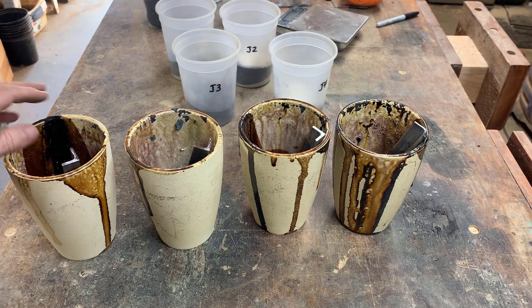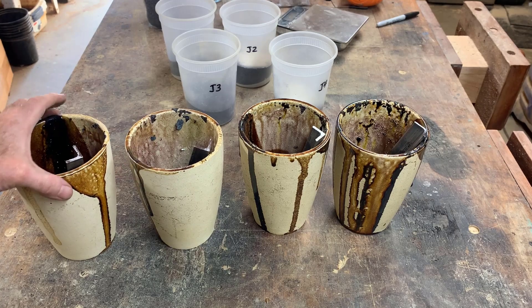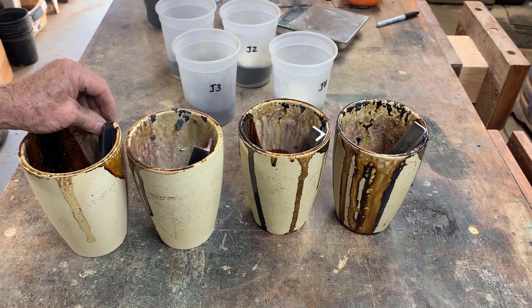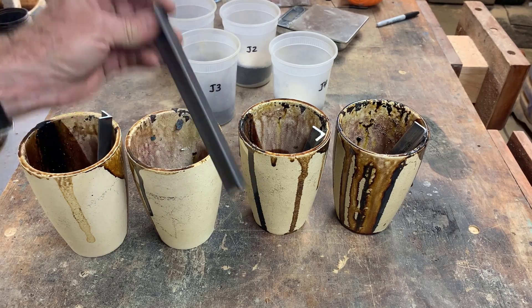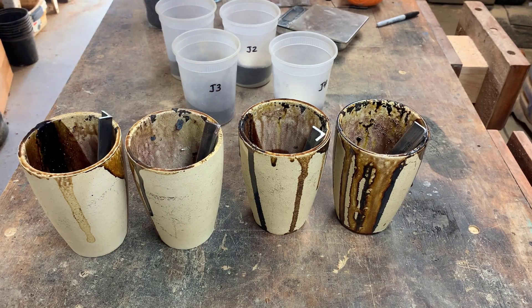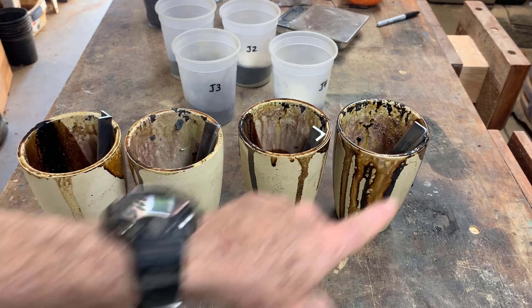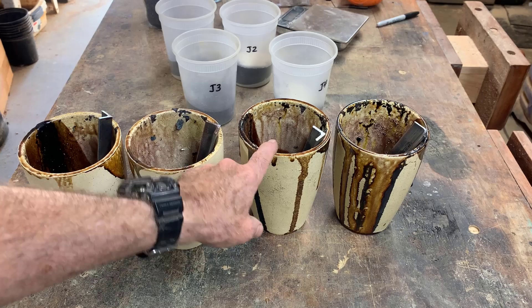I've got four A6 crucibles all set up, with a hunk of old angle iron in each one. I'm going to mix those up really well and pour each one — 1, 2, 3, 4 — being careful not to get them confused.